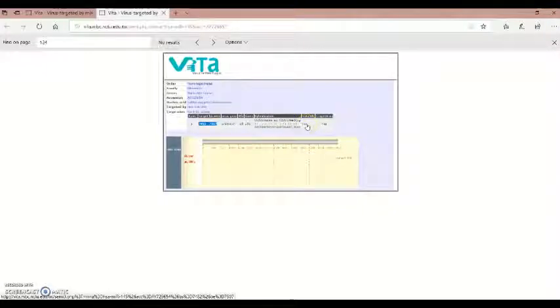If we click on Miranda right here, we open it in a new tab, and you will get a map with the current alignment present. So let's scroll a little bit down, and here we have where it binds to. It's quite interesting to note that here we have already a wobbly pair alignment. That's quite good to note at first.